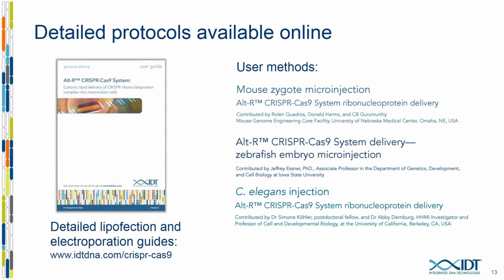And something that has been really great is we've actually been able to share some user-submitted protocols where we haven't done any model organism work here in our R&D group, but we've had collaborators that have decided to share their protocols with the wider community using these reagents to deliver into mice and zebrafish and C. elegans.